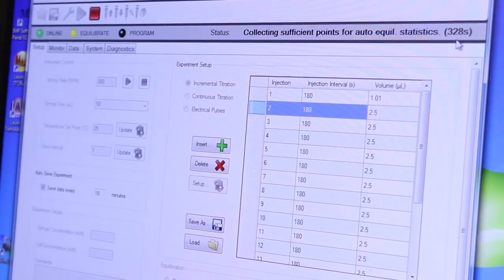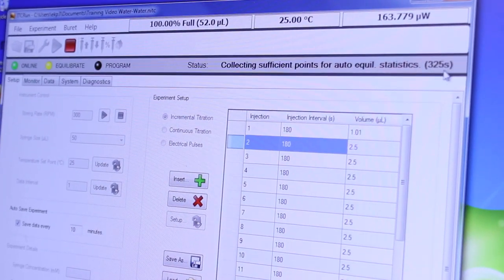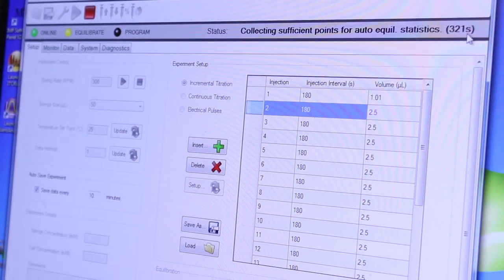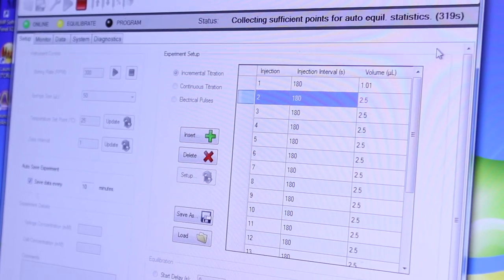At this point it will start collecting data points for the auto equilibration. Equilibration can take anywhere from five minutes to tens of minutes depending on how stable the instrument already is and how stable you need the baseline to be.